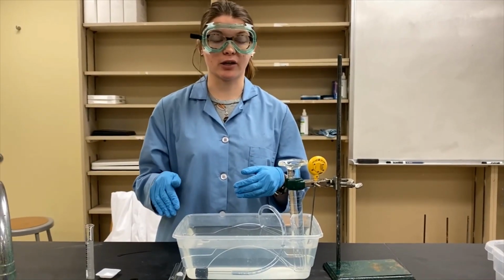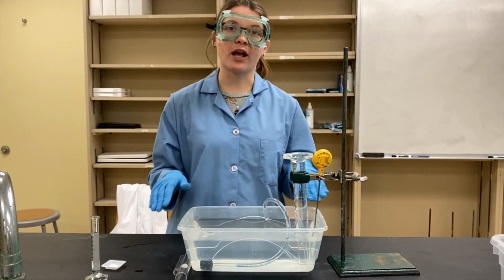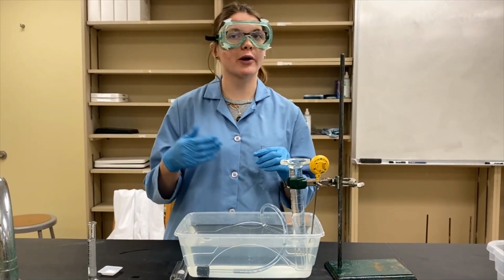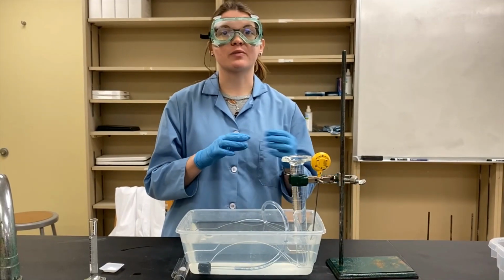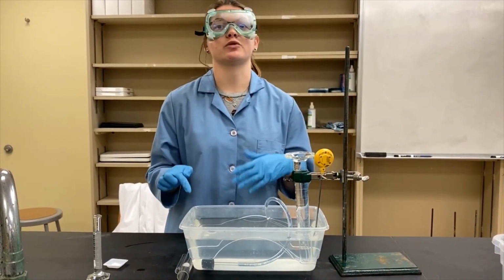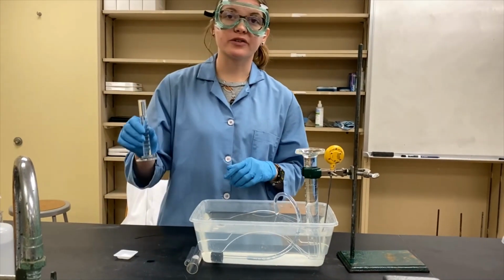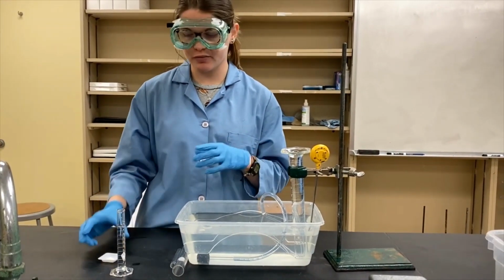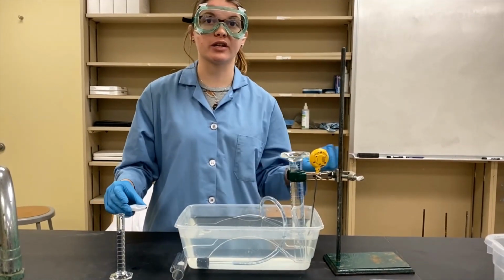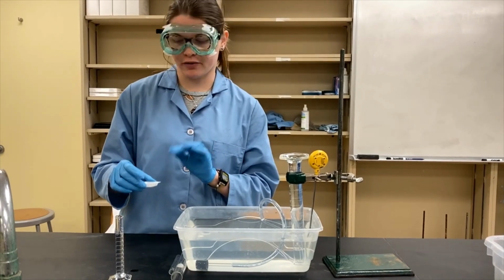Before I get started, I just want you guys to know you don't have to record any data during this segment. I'm going to throw out some numbers, but we're going to have a data table at the end of the video as well as on Blackboard for you to do your math later. So we have our 10 milliliters of 2 molar hydrochloric acid here. It is in excess for our experiment just to make sure that the gas is created to completion. And then we have about 0.36 grams of calcium carbonate here.